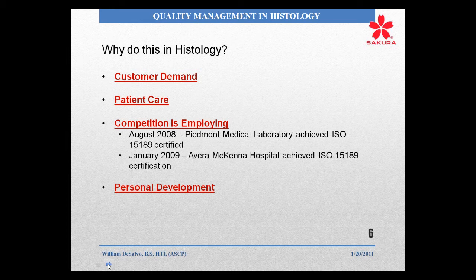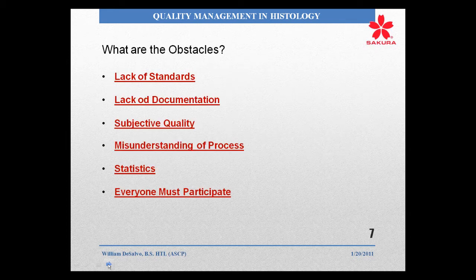And it really is important to you, to me, to all of us, that we create personal development. To do this, it's not easy. There are a lot of obstacles. There is a lack of standards for us in histology. There are good standardized reagents. We all have good standardized processes in our particular labs, but we do have a lack of standards and interoperability. So there's really no real sharing of our information from institution to institution.